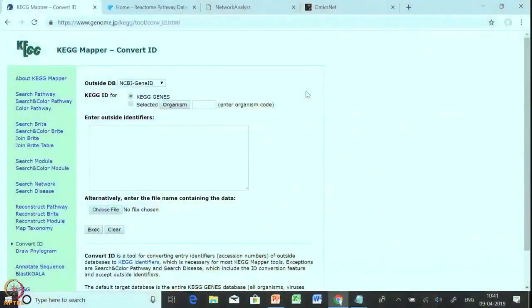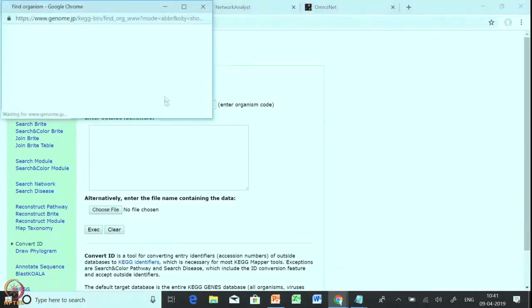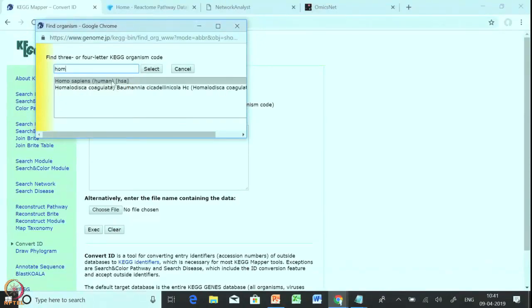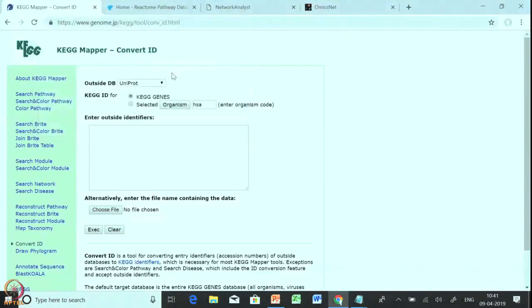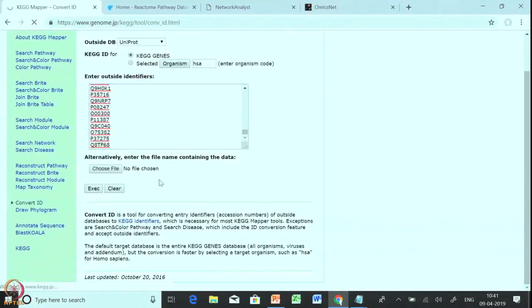This is the home page of KEGG Mapper Convert ID. In the 'Outside DB' field you can choose NCBI Gene ID, NCBI Protein ID, or UniProt ID. As I have given a list of UniProt IDs, I will select UniProt ID. Then the important thing is the organism — we write the name of the organism. Since I have taken the file from the Homo sapiens repository, I will select Homo sapiens, and it shows HSA. In the 'Enter Outside Identifier' box we will copy-paste the list of UniProt genes, then click the Execution tab. It will take a little time and give you the complete converted ID from UniProt to KEGG ID.